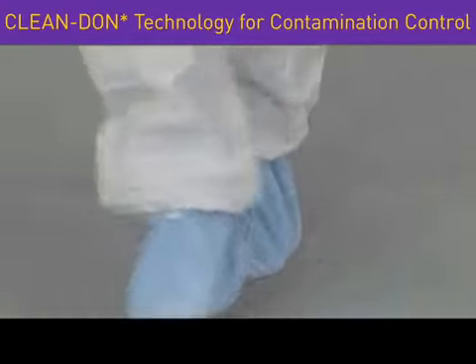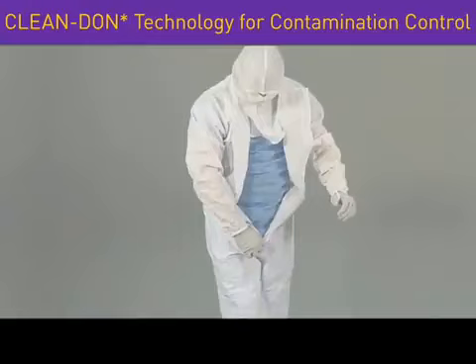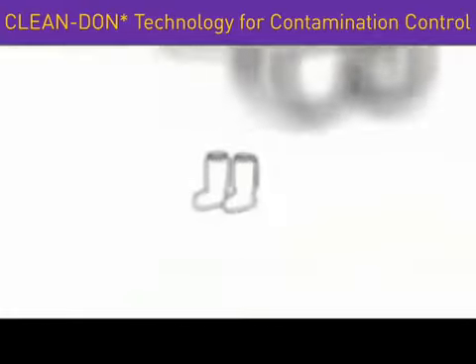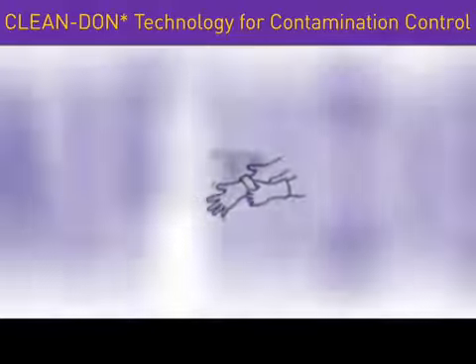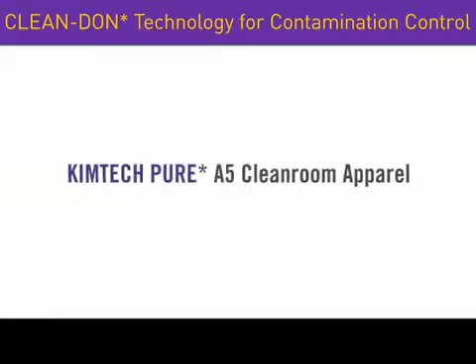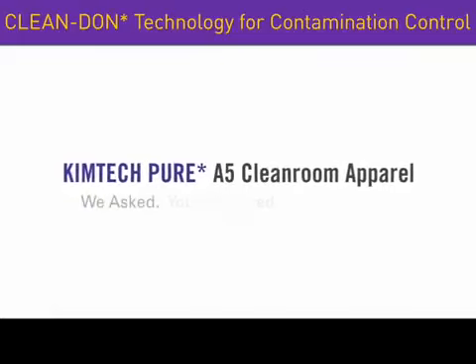Finally, cross your legs and zip up the coverall. You are now ready to complete your final gowning steps with pure confidence and comfort. The new KimTech Pure A5 Cleanroom Apparel. We asked. You answered. We delivered.